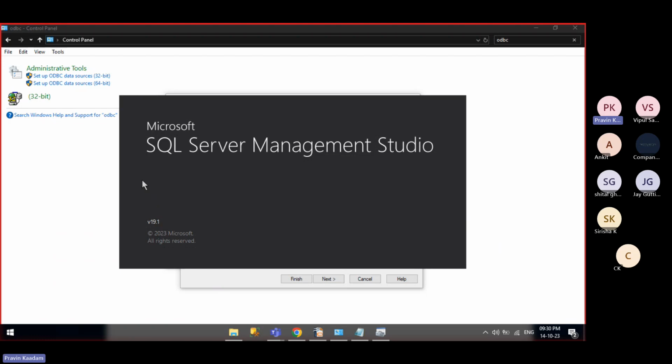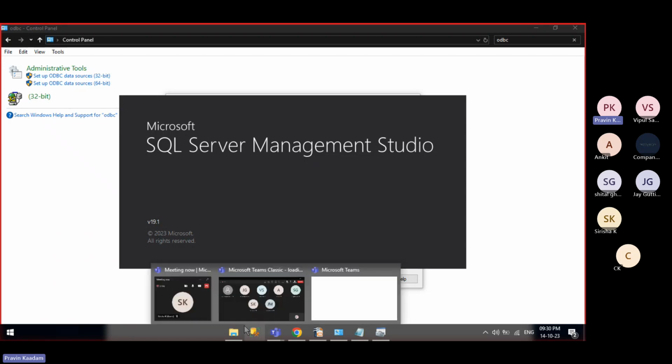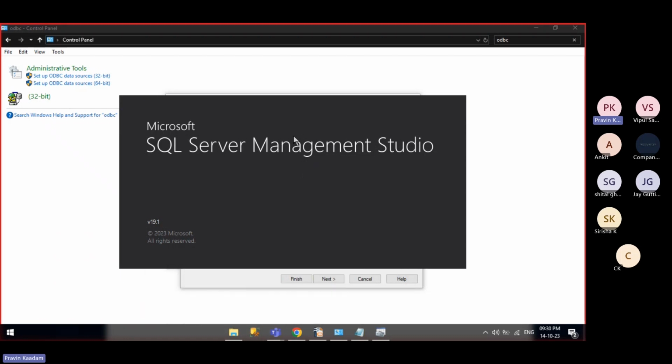One benefit of installing SQL Management Studio is that it will automatically find the host name and the server connection string. It will create the connection string automatically for you. Right now I don't know the host name of my system, so I will use the name provided to me by SQL Management Studio. So just give me 1 minute.